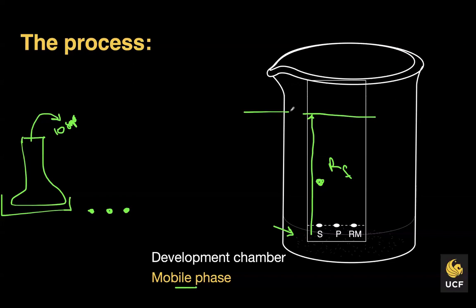And to calculate the RF value, what you take is basically the solvent front, and I'm just going to make it simple. Suppose that is 10 centimeters, and suppose your starting material, and you're really taking a ruler and measuring the distance from the line where you spotted it, how far it traveled up the plate, and suppose this traveled 4 centimeters. To calculate the RF value, you take 4 divided by 10, which would be 0.4, right?